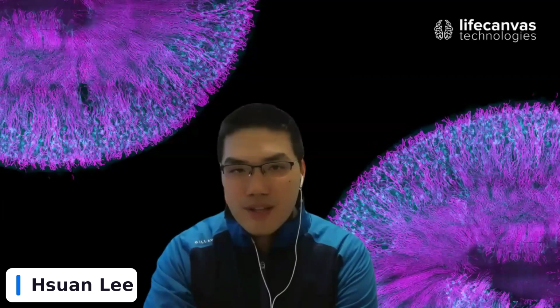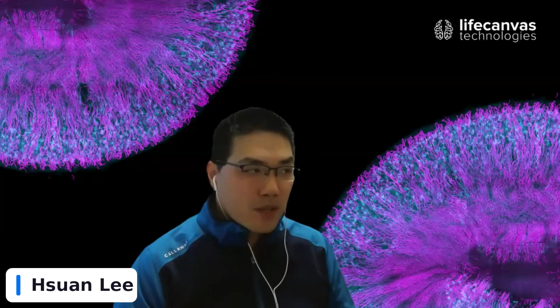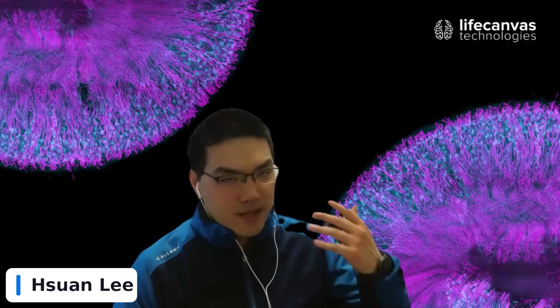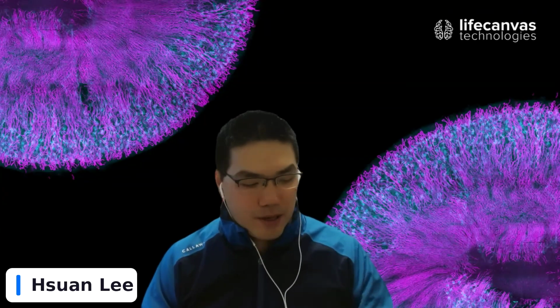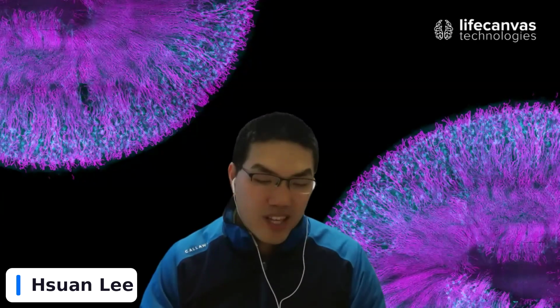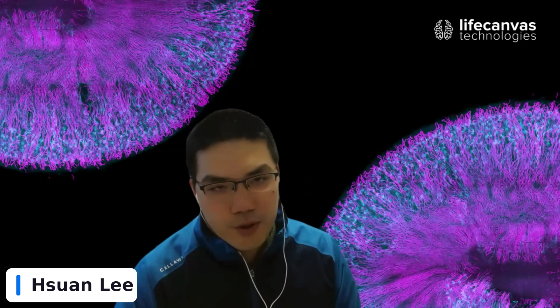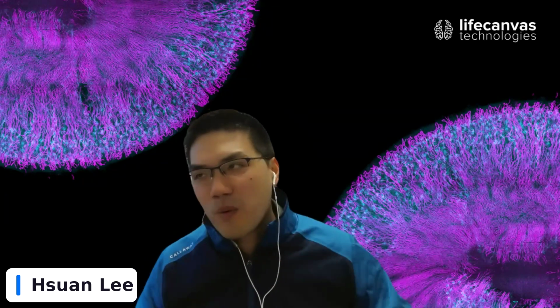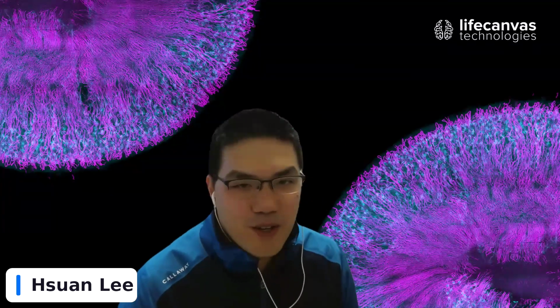Yeah, for the DALISPIM, because we have this 45-degree angle relative to the samples, we actually compromise a little bit, sacrifice a little bit of working distance for the ease of use of this configuration. So for 9x, the one that you usually use, we can image up to 5 millimeters. For the 15x, we can image up to about 3 millimeters. We're working on different versions to basically rotate the optics. So eventually we might be able to make it compatible with 22x, but that might be later this year, down the road.